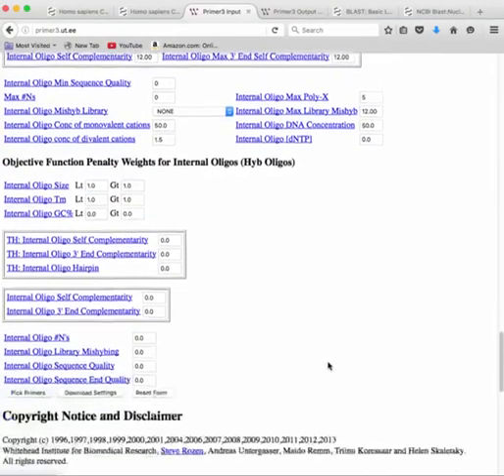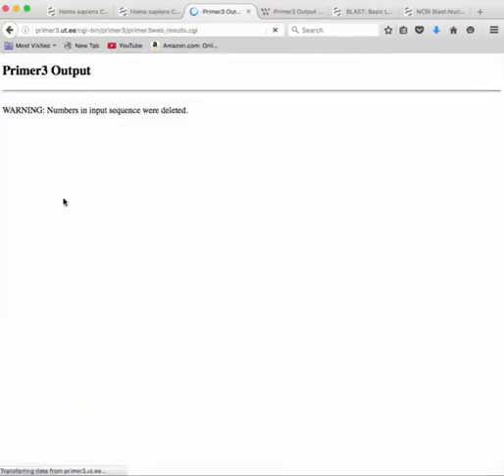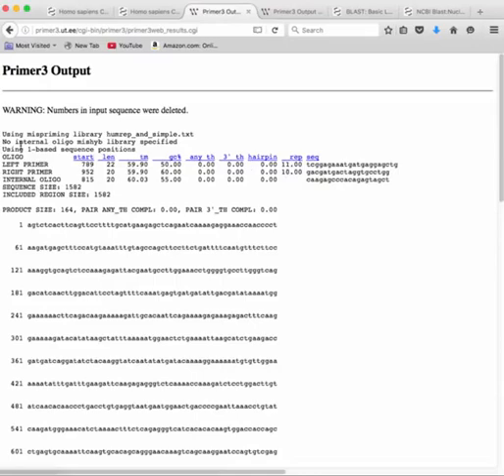So then I go down and I say pick primers. Once I do it, it will select the primers for me. As you can see, the start of this primer is 789. It is going for 22 bases of length. So it covers my junction region, exon to exon junction region, which I said should be around 800. So that is covered. This is the information I get.